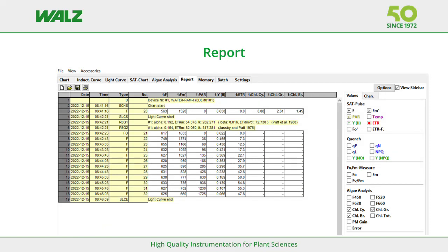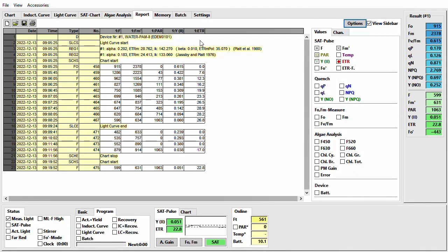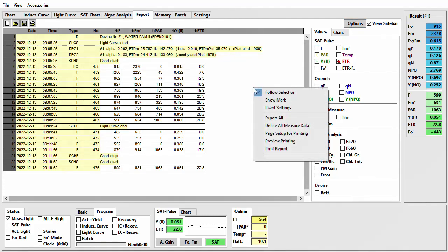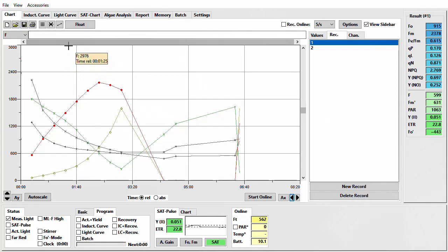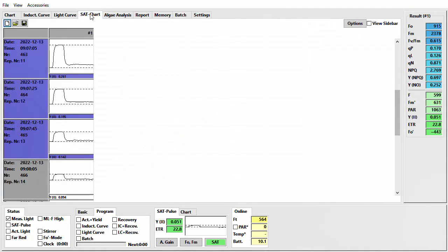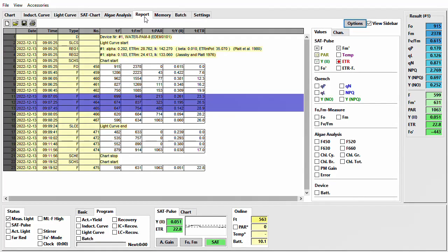The next tab is the Report tab. In the Report tab, all saturation and algae analysis measurements are listed. As always, in the sidebar you can choose the displayed parameters. Next to the View Sidebar is an Option button — the Option commands are also available when you do a right-click. Follow Selection is normally activated: when you mark measurements in the chart, the corresponding SAT chart kinetics and report data will be marked as well, and the program will jump to the marked saturation pulses.